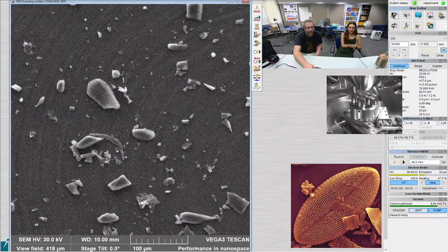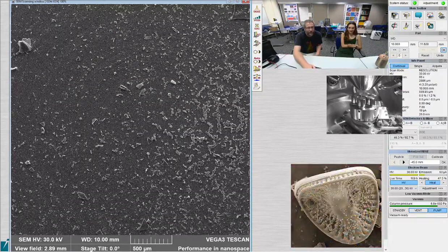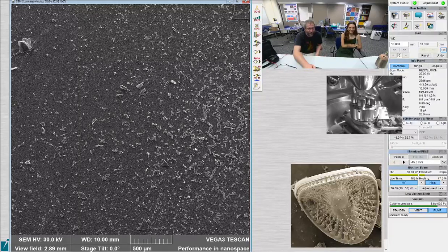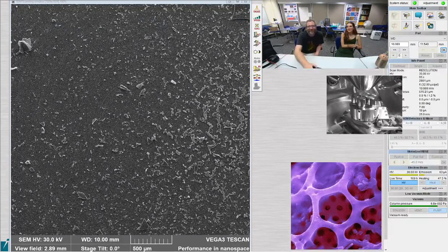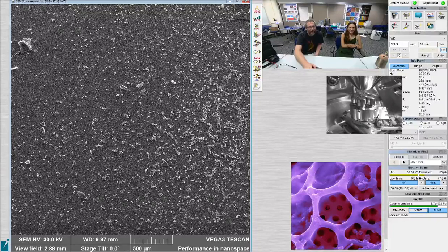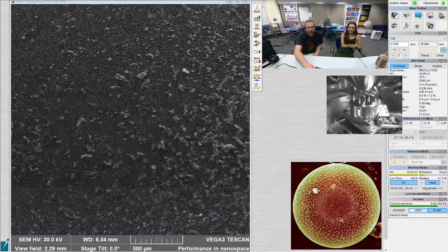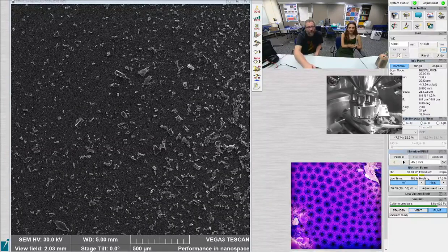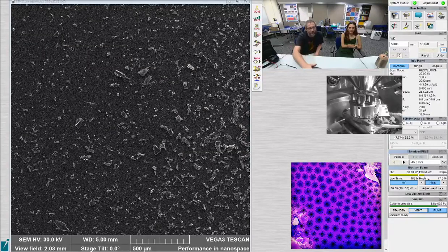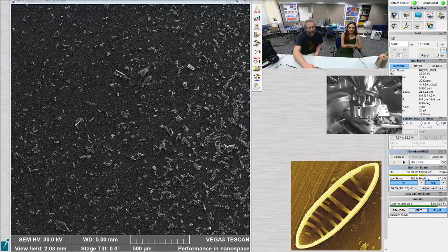Okay. So, what we normally do is minimum magnification so we can see how well the slide is prepped. Whoever did this did a great job. I did these myself. Shout out to you. That's right. For once, they're done the way I like them. And now we're at minimum magnification. I'm going to zoom us a little closer. That's as close as we get. So we're now 5 millimeters between us and the sample, so we've got a little bit of wiggle room, but not much. And we're up to temperature, and we are more or less where we need to be.